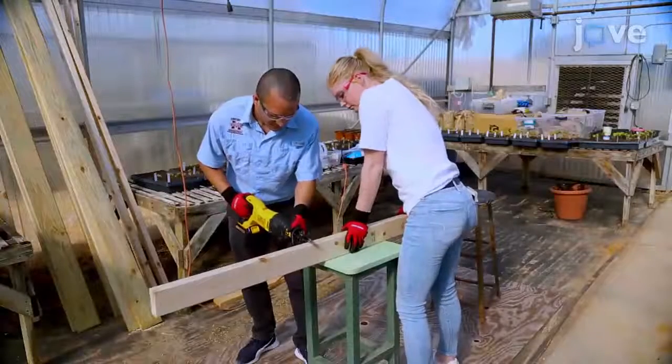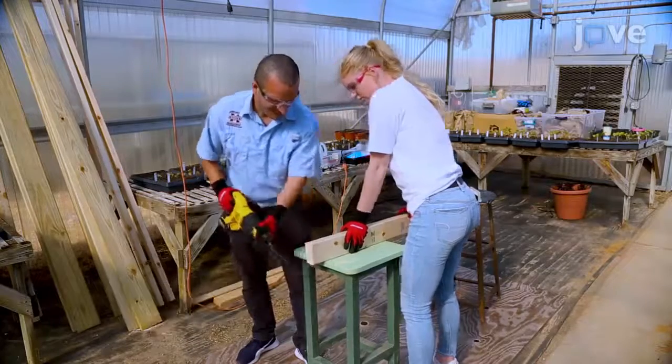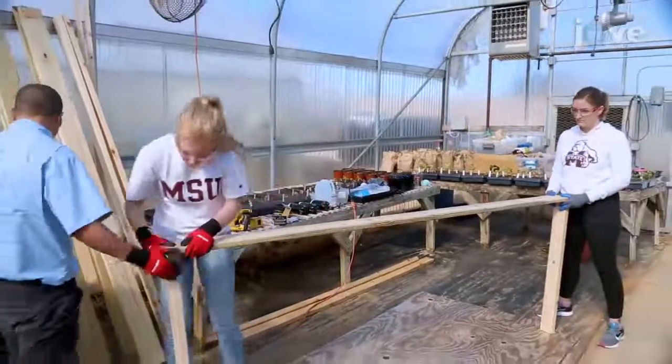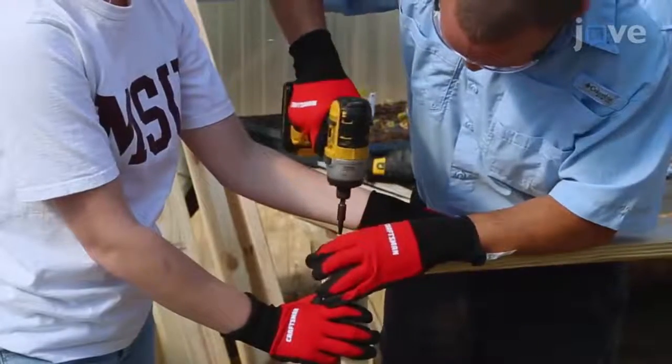Cut wood into appropriate sizes and amounts as listed in the text protocol. For the tallest level, stand one 2.44 meter board across two 0.91 meter pieces on each end of the edge and drill 2 screws vertically into each of the 0.91 meter pieces.